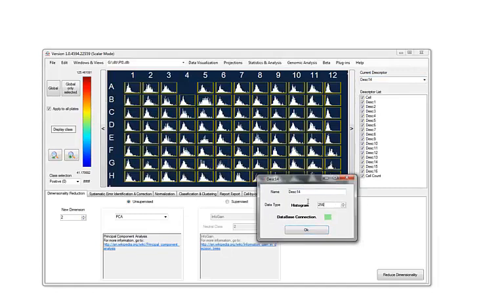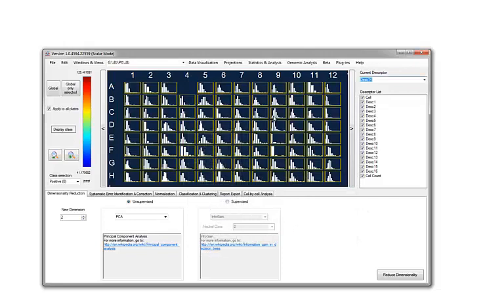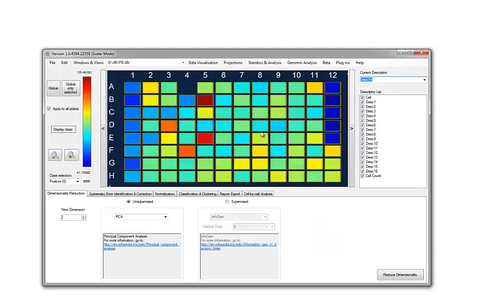As you can see, we can edit this value. What you have to understand is that the number of bins of each histogram has no consequence on the data themselves. It's just a way to display those values. So if we move, for example, to something like 10, you can see that the histograms are changing, and of course the number of bins is changing too. Now we can come back to average view and nothing will have changed.